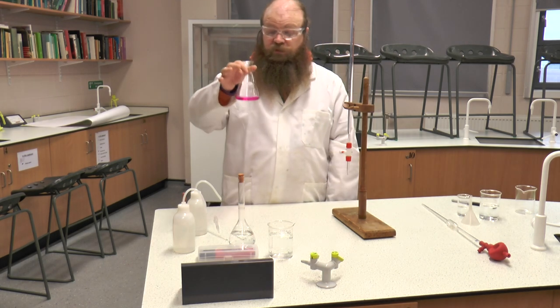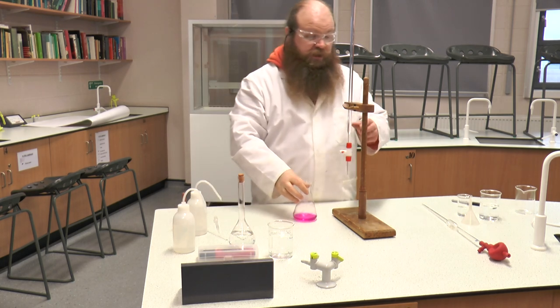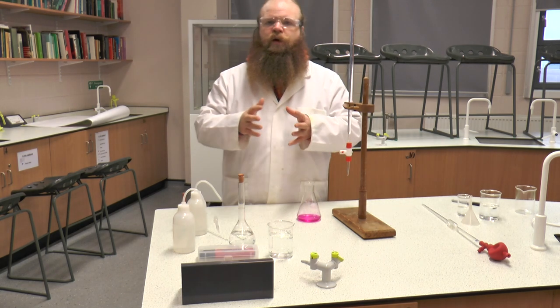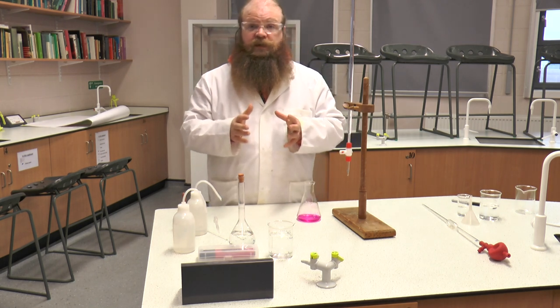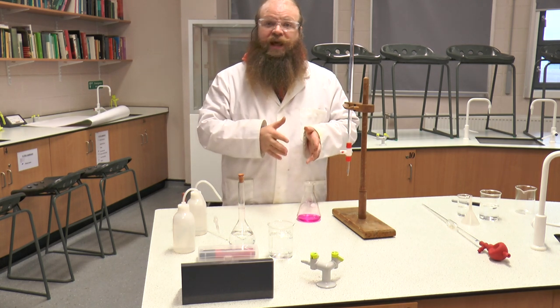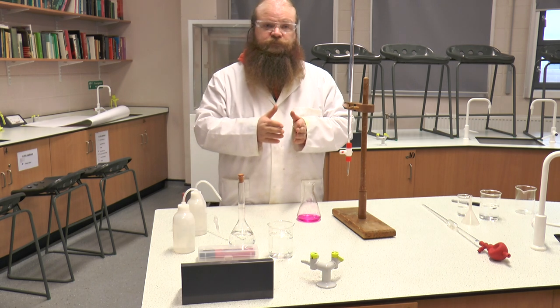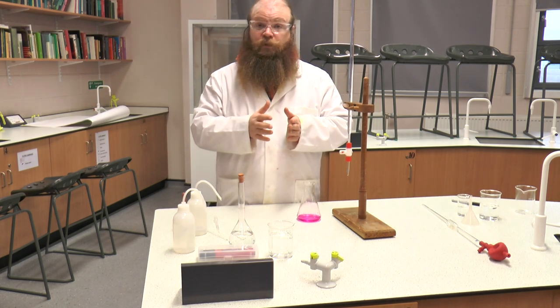The end point, going in reverse with the acid, at the point of neutralisation, will be when the pink just disappears. The first titration we do is what we call a quick or rough titration, which means that we are trying to determine approximately where our end point is. Once we've determined that, we will be able to do fine titrations, which are more accurate, and hopefully be able to get three concordant results within plus or minus 0.1 of each other.